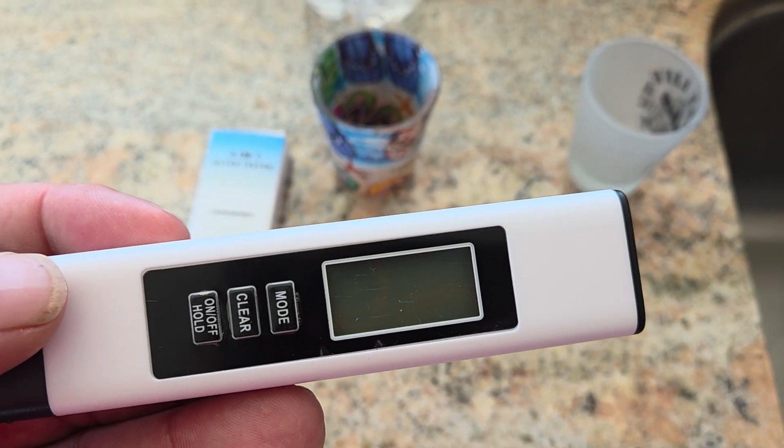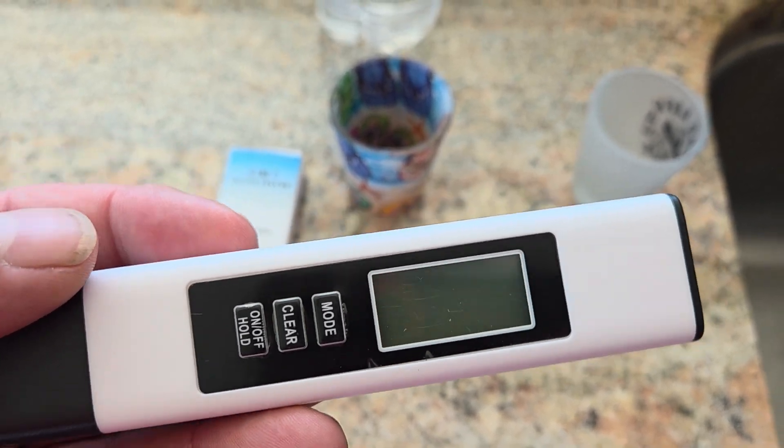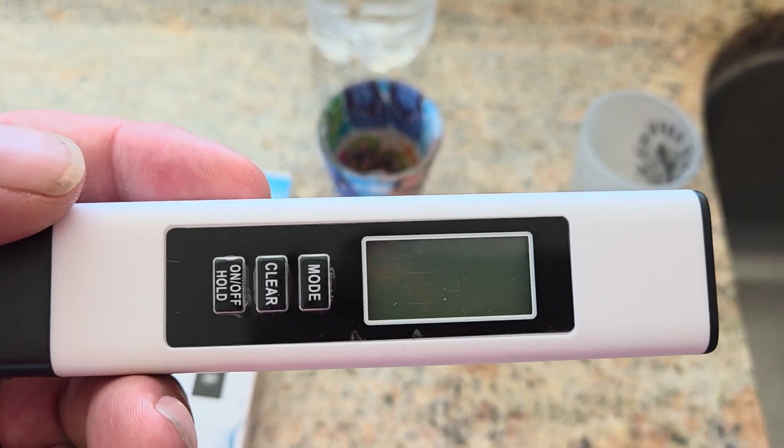This 4-in-1 digital water tester by Maxabee — I think I'm saying that right — I've had it for 4 or 5 days. I bought it because, well, I was just curious.